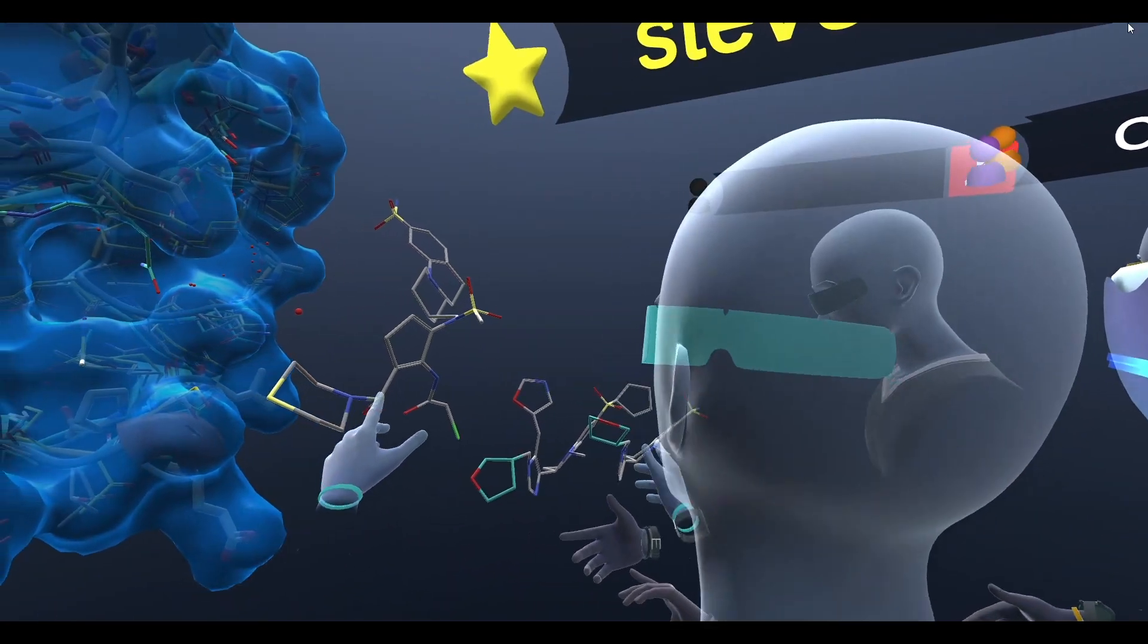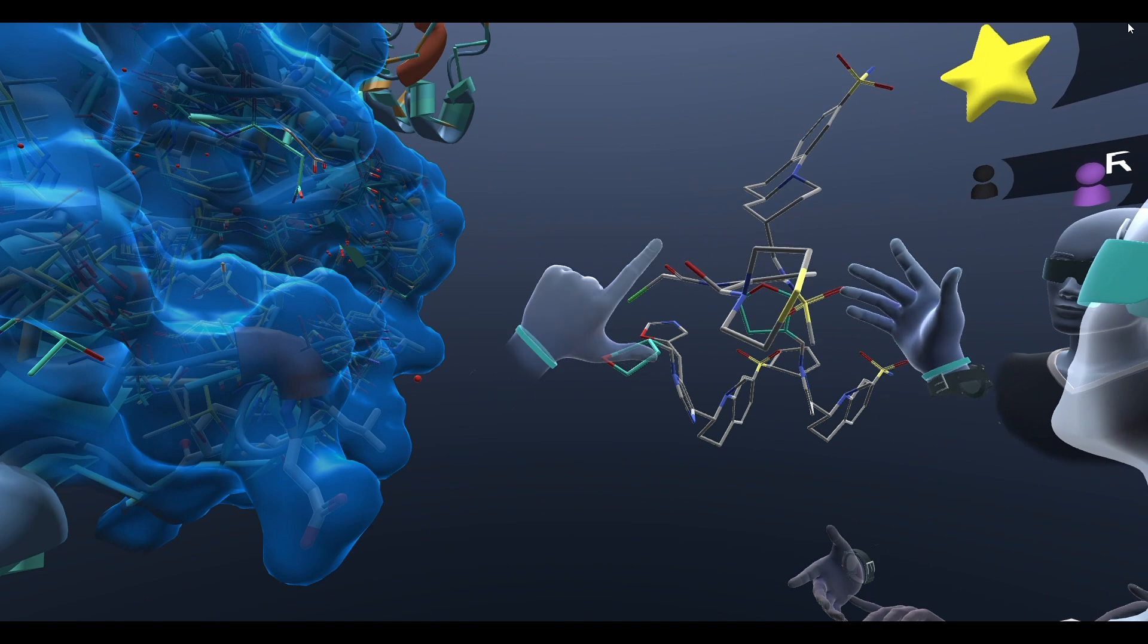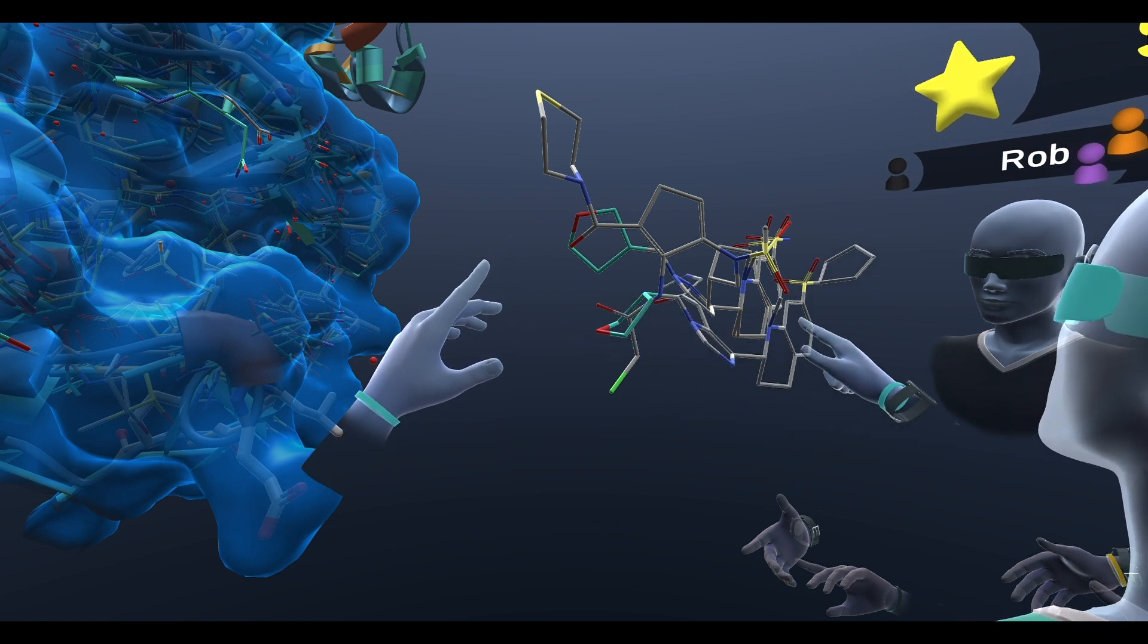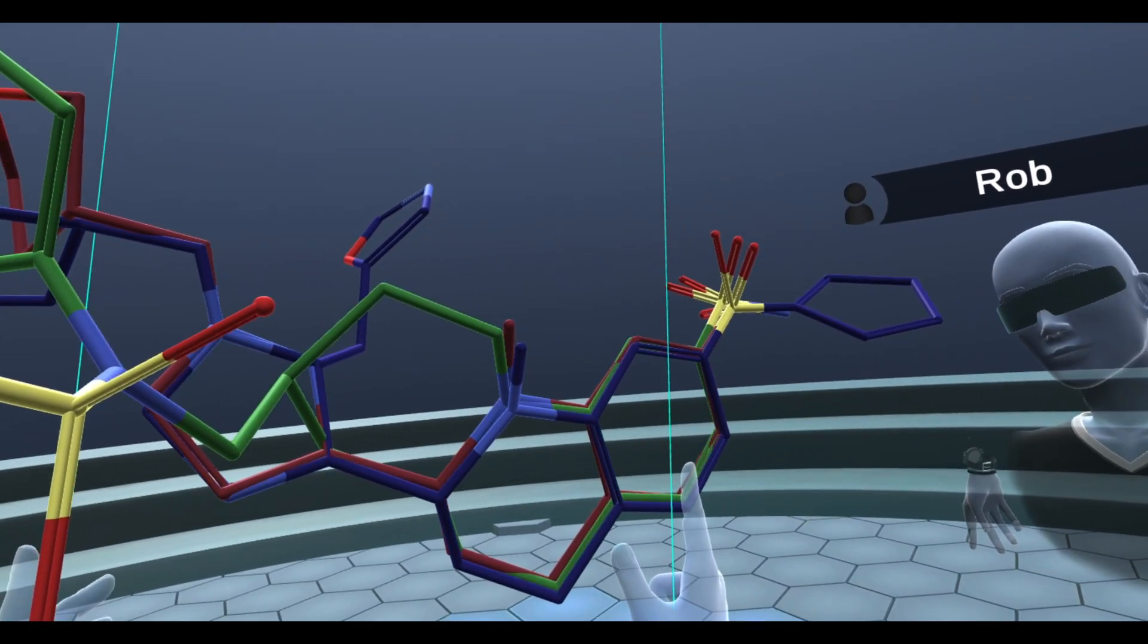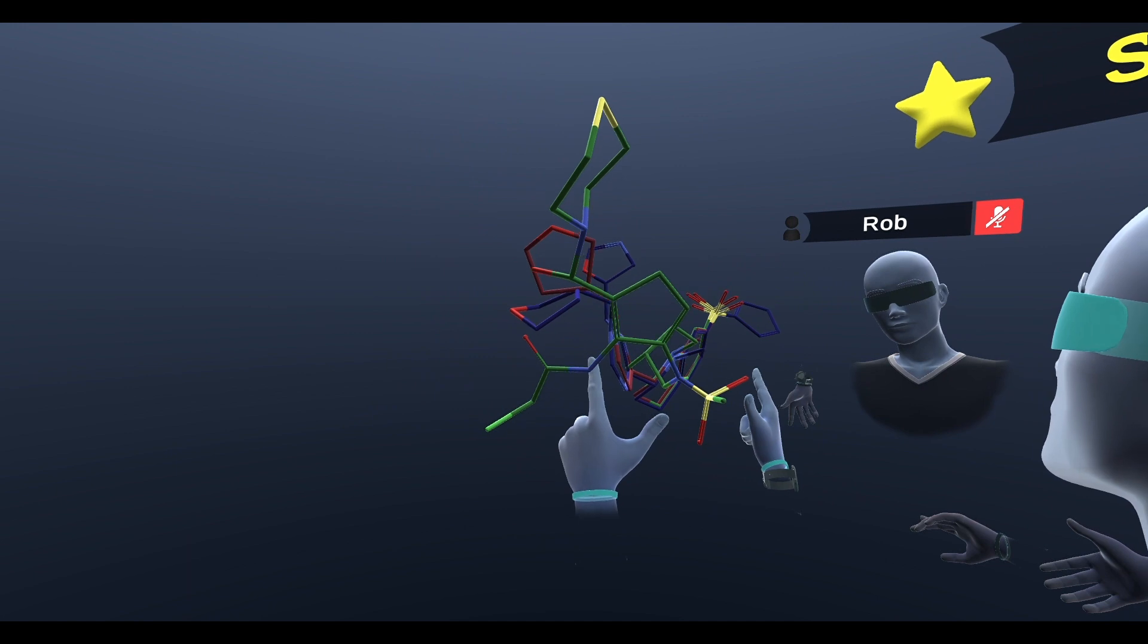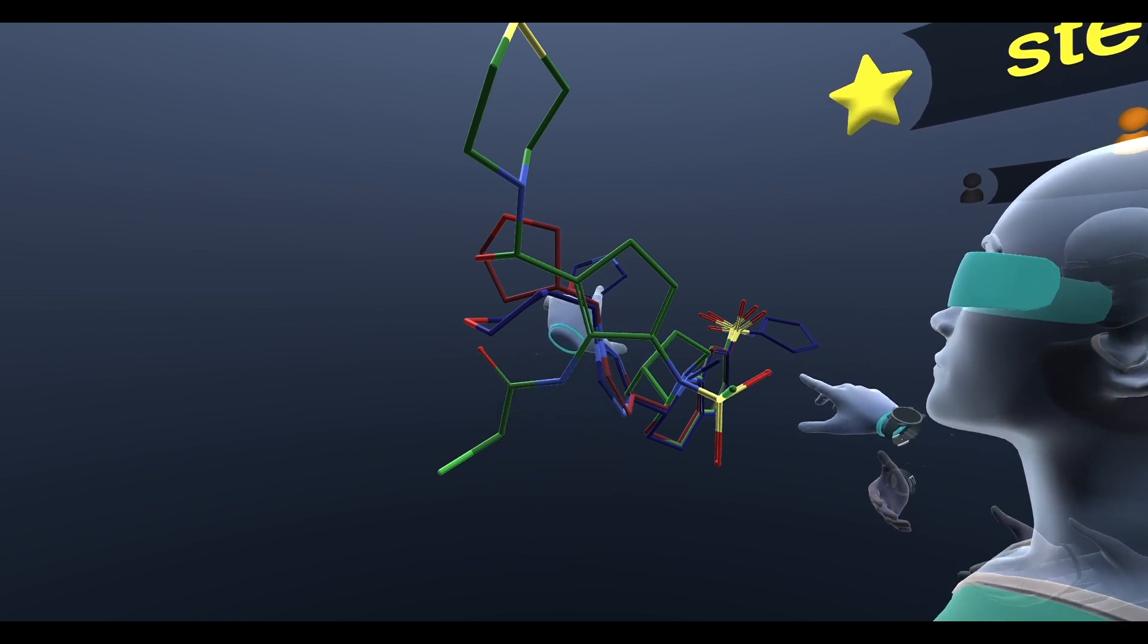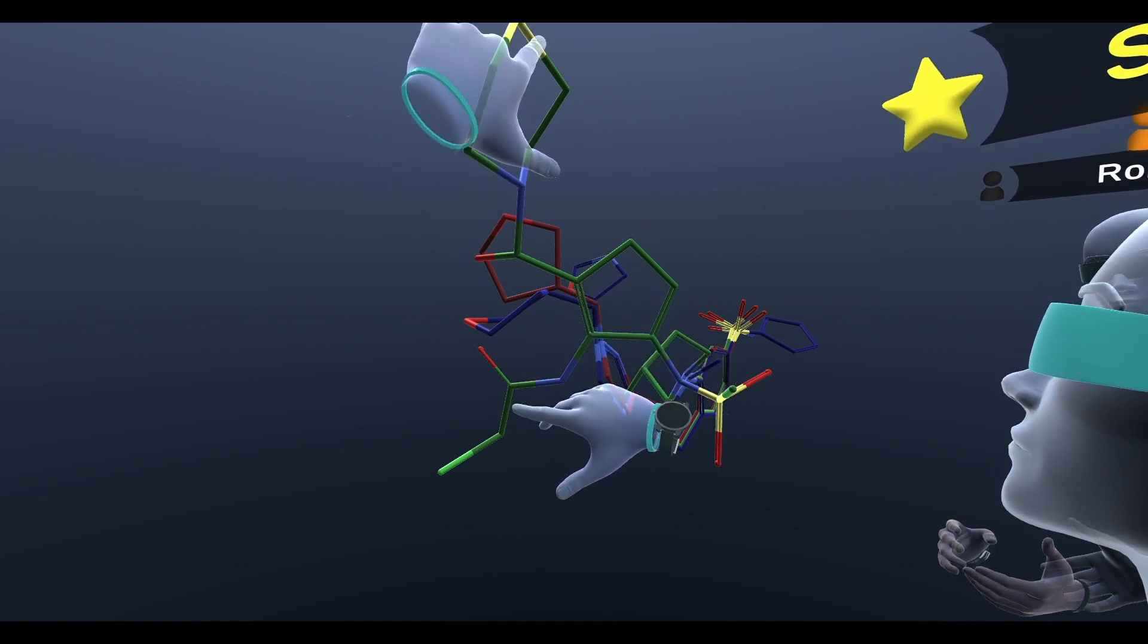And so now we should see all of our chemicals that we designed here. So we got my molecule, and then we have Mike's molecule, and then we have Rob's molecule. Cool. And so yeah, we could see that there was a lot of overlap—very similar structures—but we each made a few different variations. So Rob was the only one that put this five-member ring over on that side and the only one that really built out there.